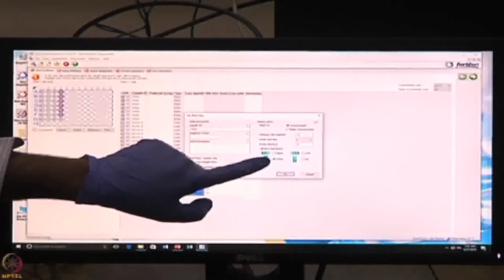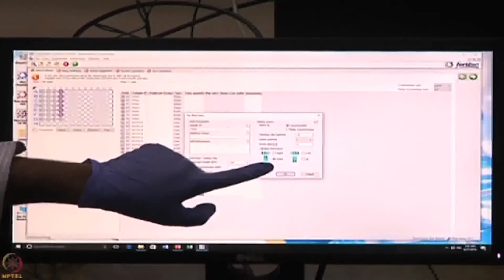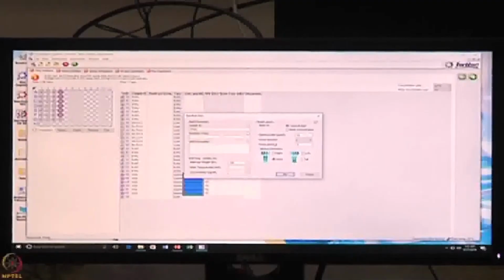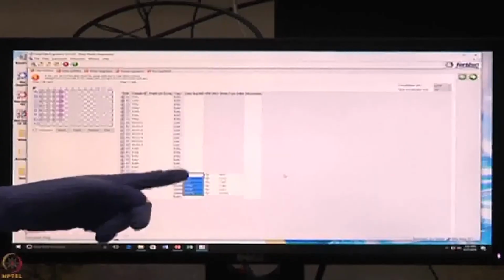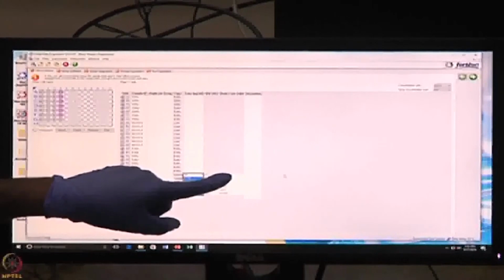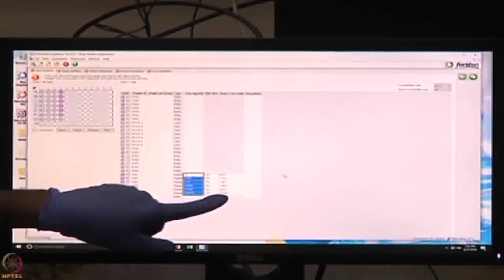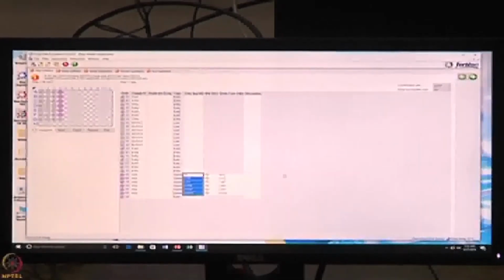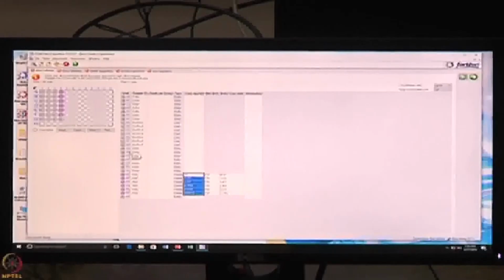The black dot is the highest top concentration, and the lighter one is the lowest. I am using this format. If you have fed the information the other way, you can go low to top, that is also possible. Then I will say OK. Automatically, you get a 3-fold dilution. So the KD range covers from 66.67 nanomolar, through 6 concentrations at 3-fold, all the way to 0.2 nanomolar, roughly equivalent to 200 picomolar. So these are the things you feed in the plate definition.